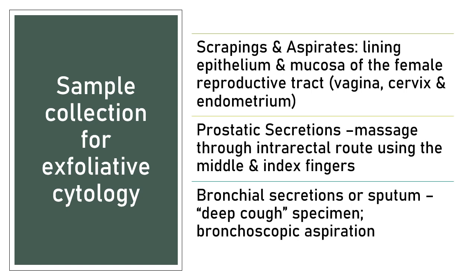Let's take a look at your samples for exfoliative cytology. You have your scrapings and your aspirates from the lining epithelium and mucosa of the female reproductive tract, from your vagina, from your cervix, and from your endometrium. Then you have your prostatic secretions, which are obtained through massage of your prostate via the intrarectal route using your index and middle fingers.